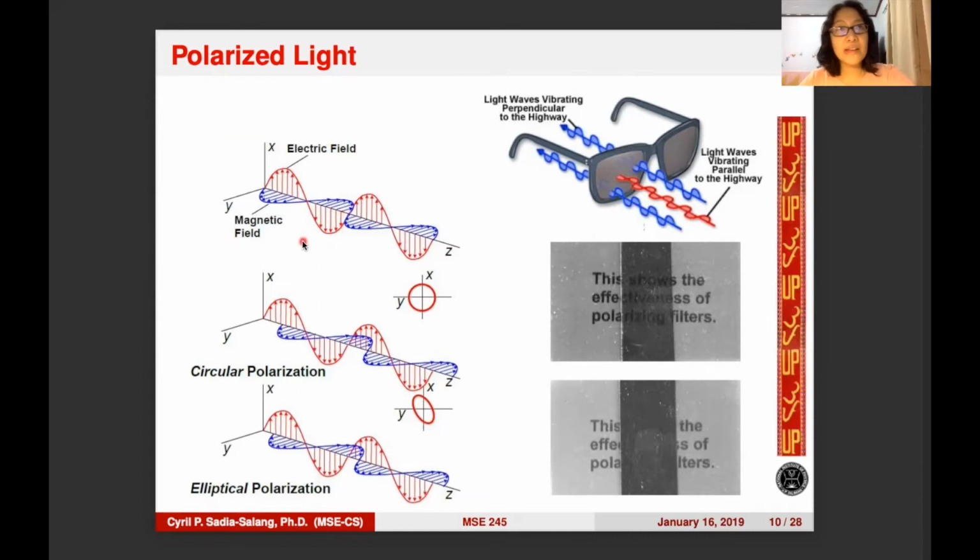When there is a polarizer, one component of incident unpolarized light is absorbed, resulting in emerging polarized light, such as circular polarization and elliptical polarization. Recall that the electric field vector vibrates in the direction perpendicular to the propagation. Circular polarization is a polarization state in which at each point the electromagnetic field has a constant magnitude and is rotating at a constant rate.